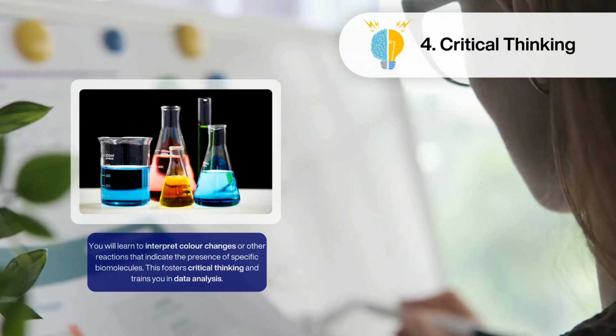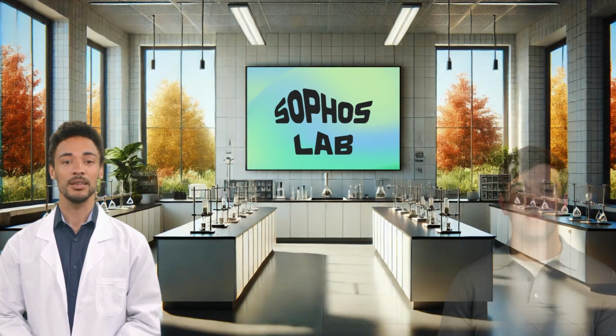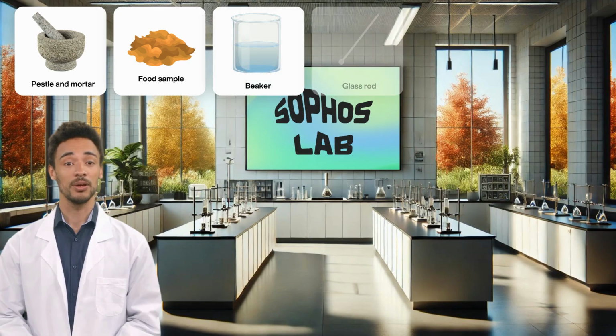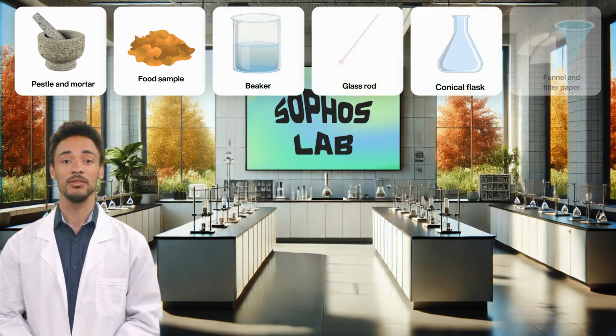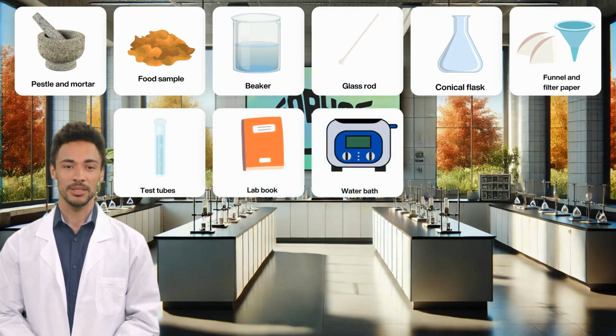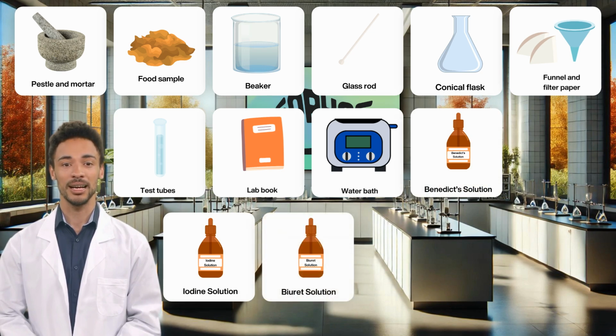Let's start by gathering our materials. Sam, what do we need? So for this practical, we need a pestle and mortar, a food sample, a beaker, a glass rod, a conical flask, a funnel and filter paper, test tubes, a lab book, a water bath, and numerous solutions to test the food. For this experiment, we will be using Benedict's solution, iodine solution, biuret solution, and ethanol.